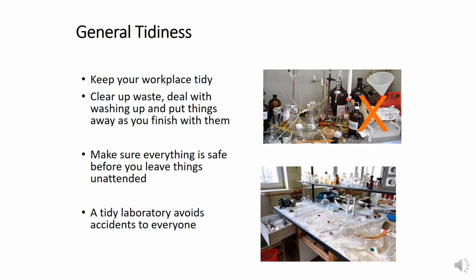And then if we talk about general tidiness, of course, at the end of the day when you finish your experiment, always clean the working places and put all the chemicals or supplies that you used back into their original positions.